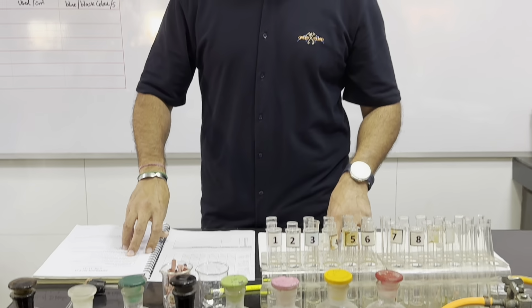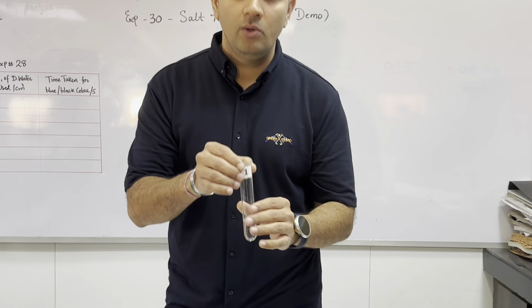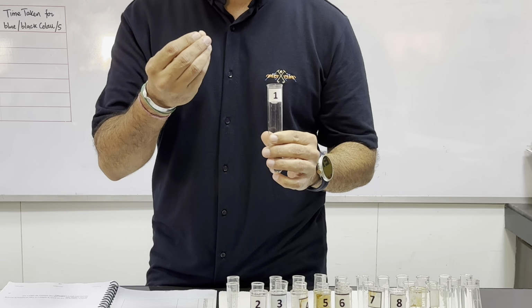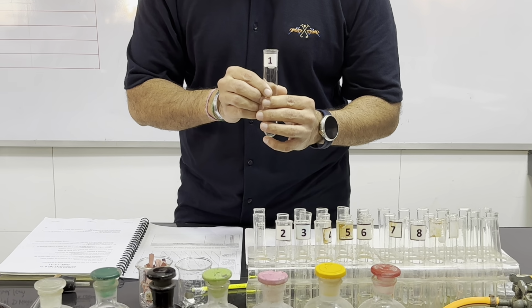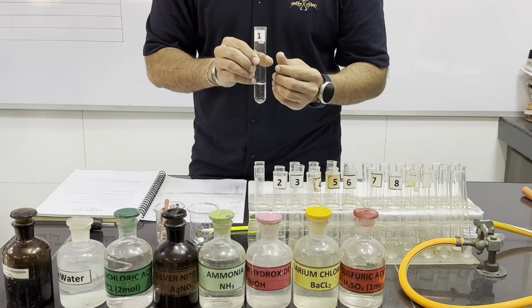In order to test for carbonate ion with the acid, what we do is we take our solution of Fa1 and then we add acid to this solution, and the gas which is given off must be passed through lime water in order to confirm whether the fizzing is of carbon dioxide or not. If carbon dioxide is given off, the lime water will turn milky white.